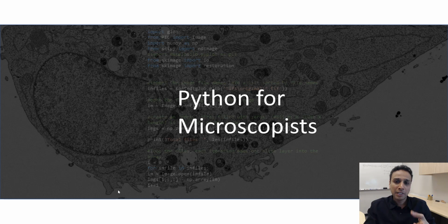Now the kernel can be a linear filter, like a Gaussian kernel, and I'm going to talk about that in a second. And the other type of filter is a non-linear filter. One example is a median filter. Typically non-linear filters preserve edges, and again, we'll demonstrate that in a minute. A median filter can be a great filter that does preserve the edges and then cleans up the image a little bit.